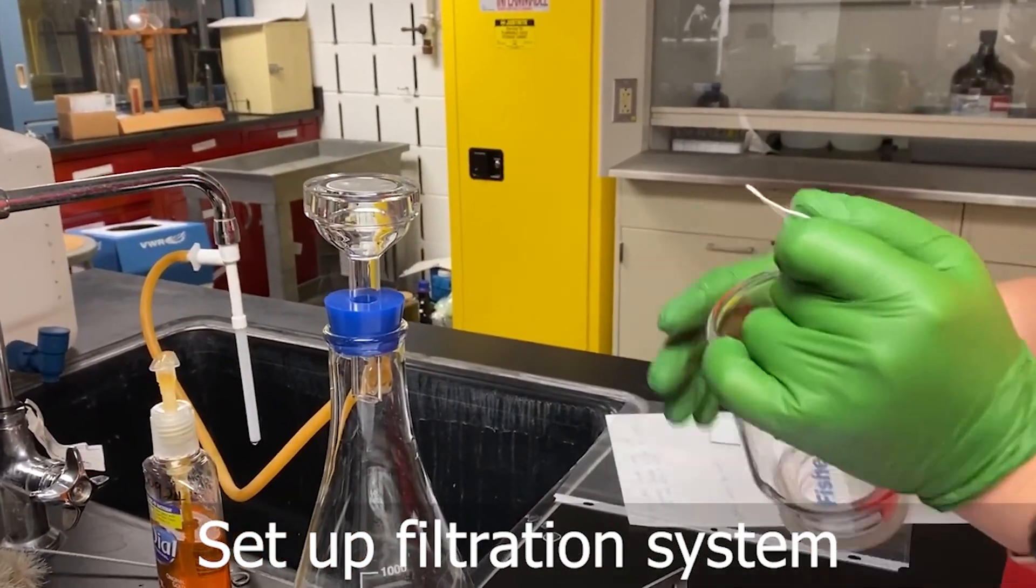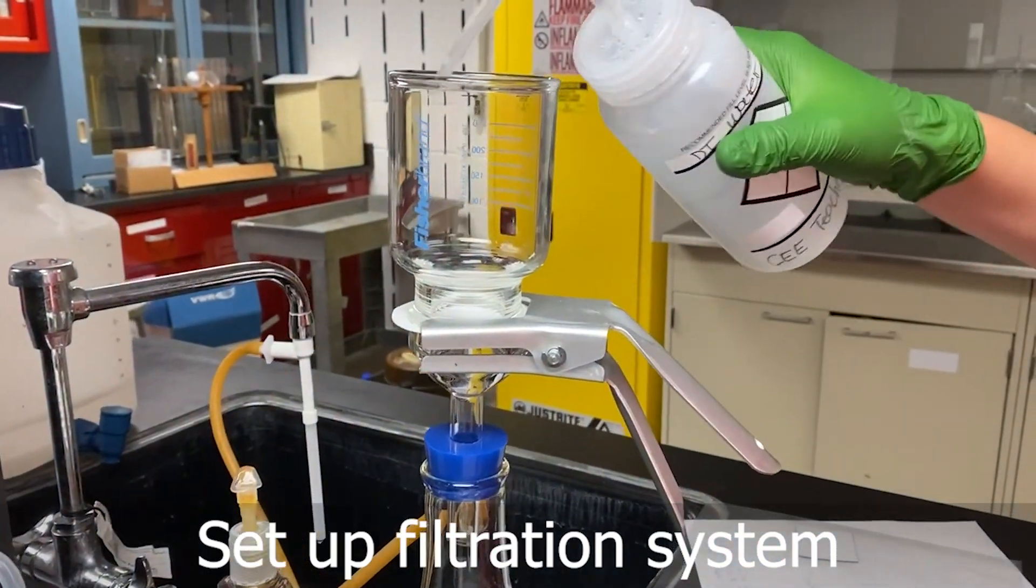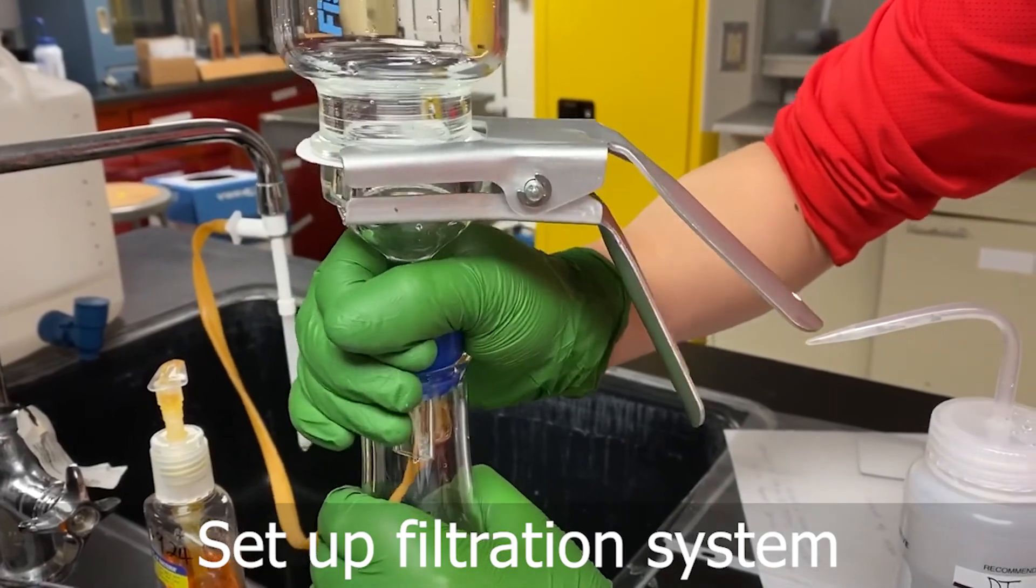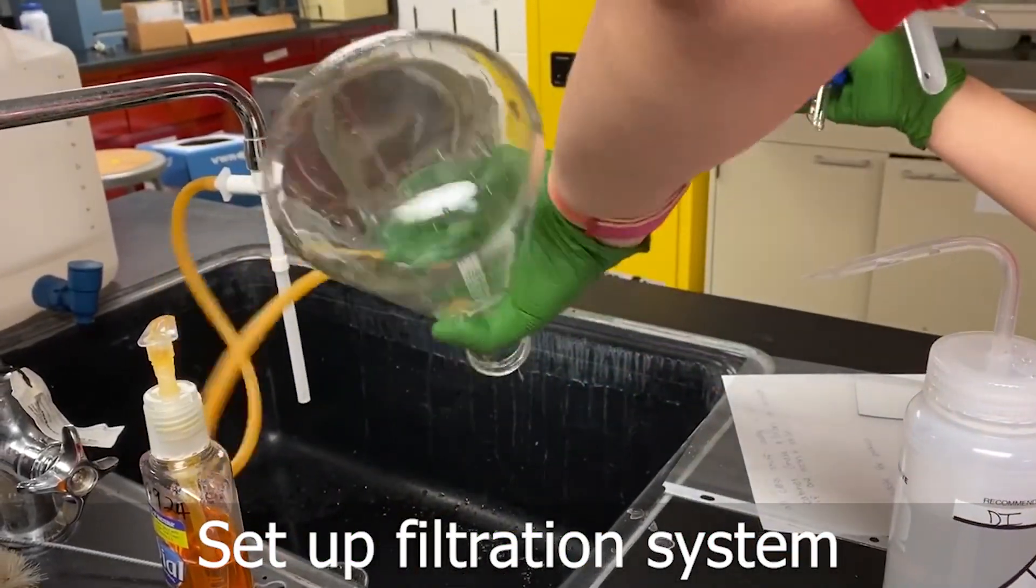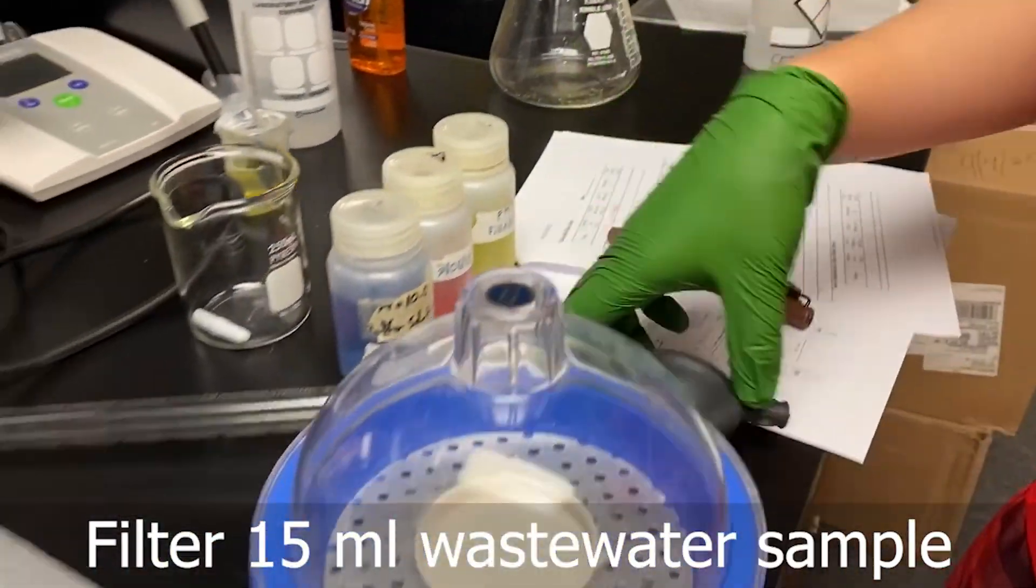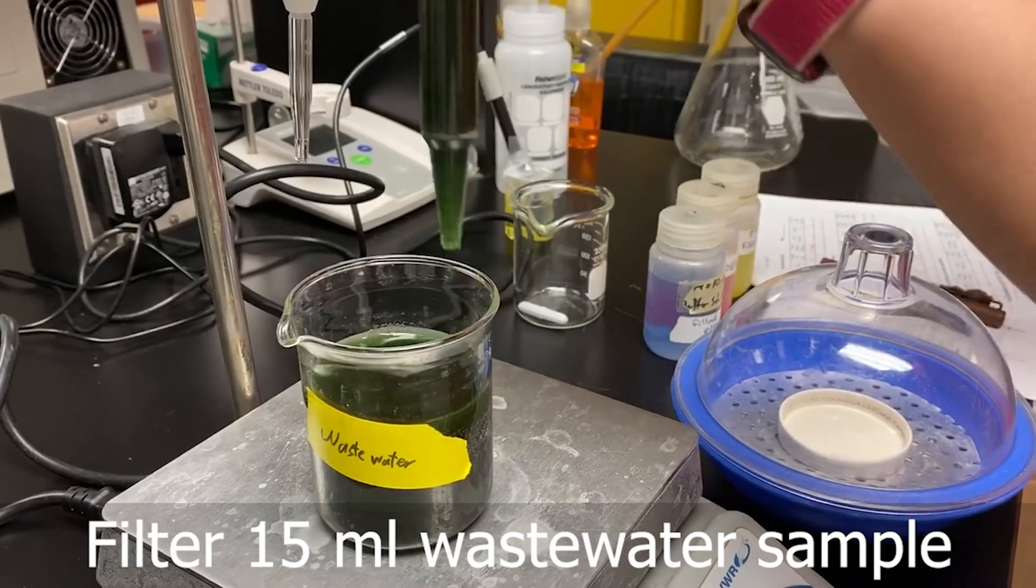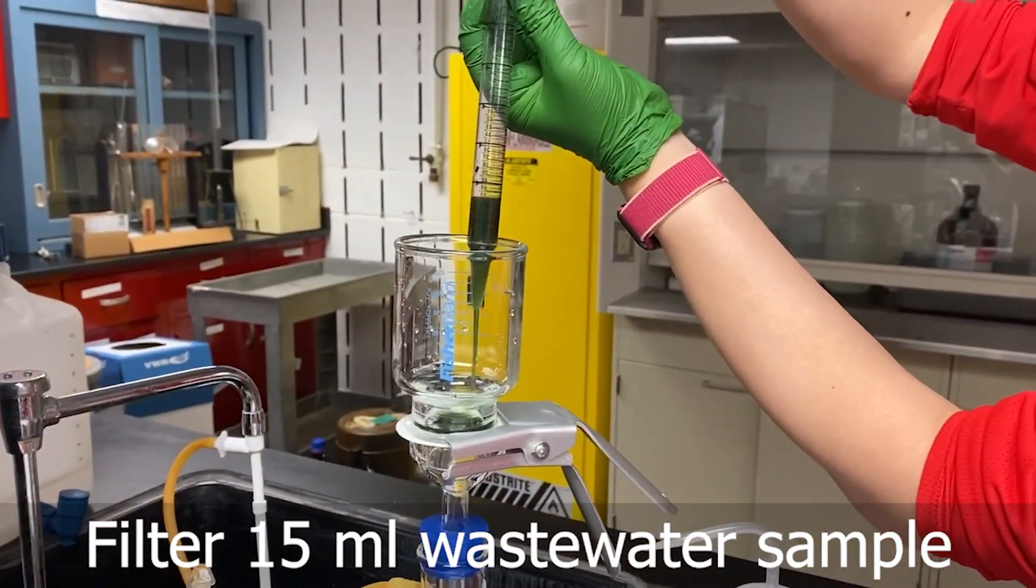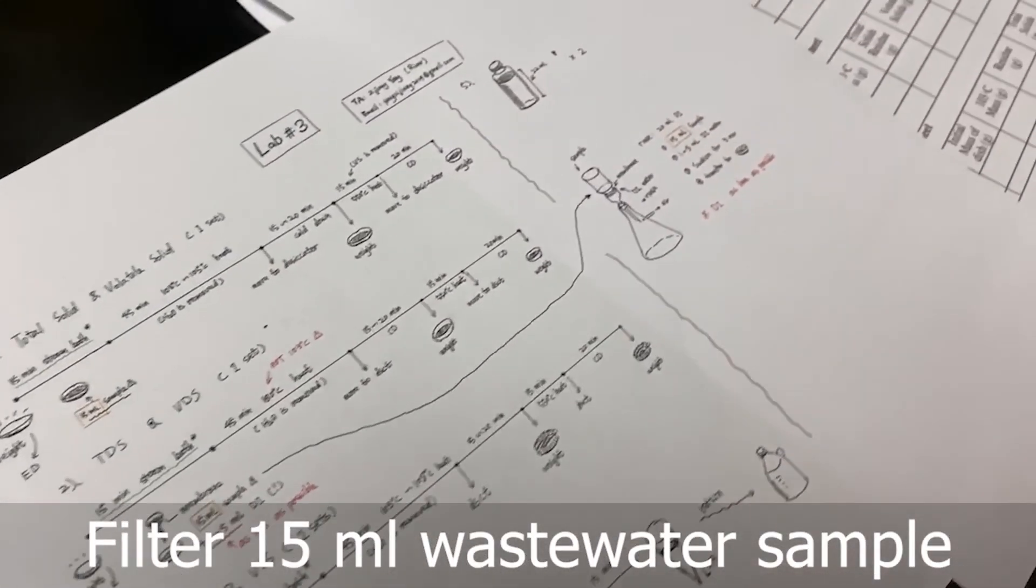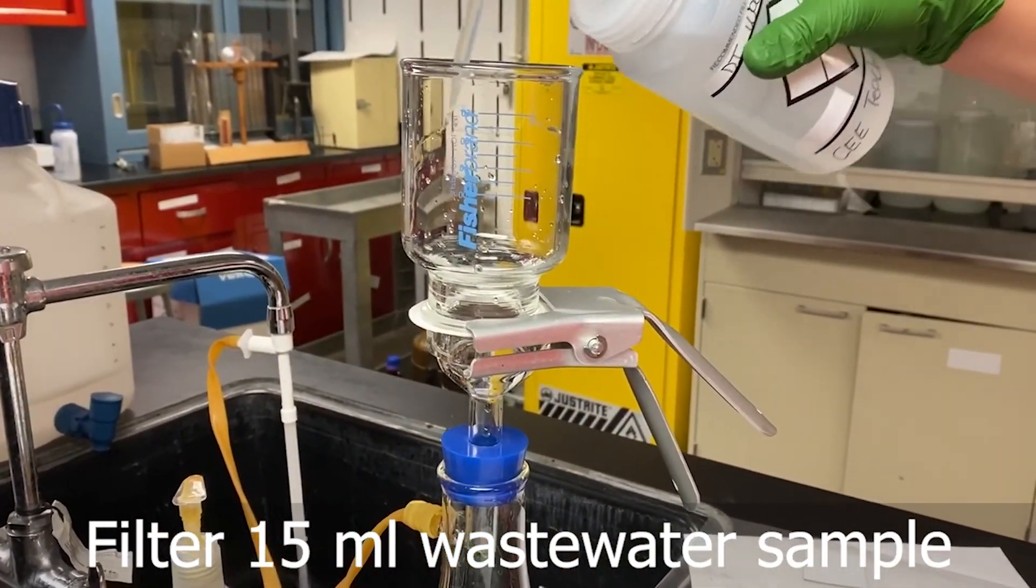And then we are going to use the filtration system. We lay the filter here and then set up the system. We set up the filtration system first, and after that we remove everything to make sure it is clean. Then we can take 15 ml of sample and use the filter. Then we can start vacuum filtering it.